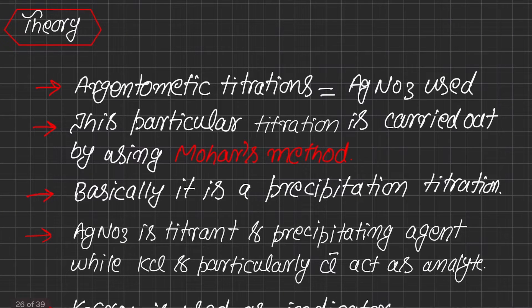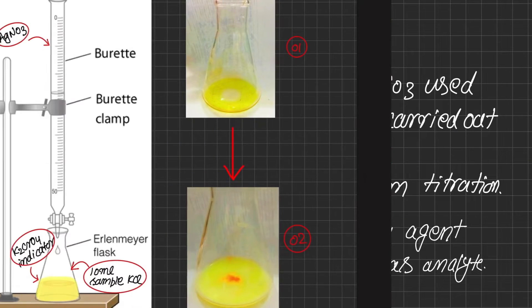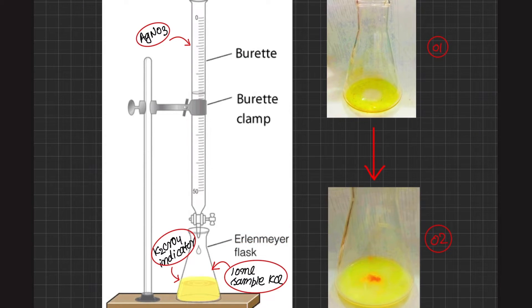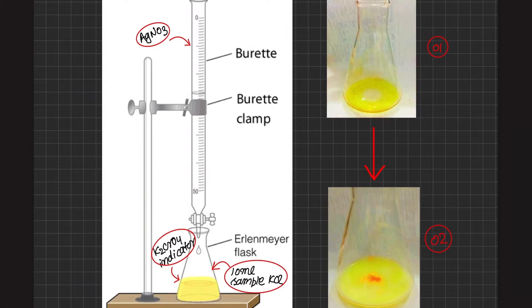Now we will see the procedure of this titration. Since silver nitrate is the precipitating agent, it is taken as the titrant in the burette. In the flask, we add 10 ml of sample solution and 2 to 3 drops of K₂CrO₄ as indicator. As we add the indicator, the whole solution turns yellow in color due to the color of K₂CrO₄. Silver nitrate is then poured down into the flask and silver chloride precipitates are formed.